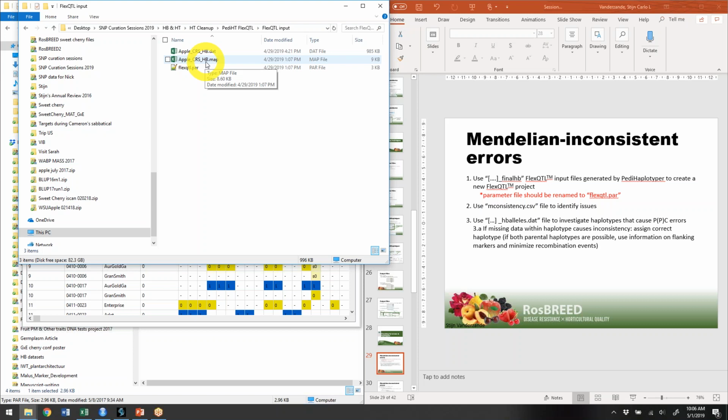Secondly, at this point, it might be a good idea to reintroduce the parents of the intermediate ancestors, because by this point everything has been phased and determined. At this point, we do want to make sure that whatever was in some ancestor still matches our offspring or one of their further descendants. So it is good at this point to bring back in that pedigree information.